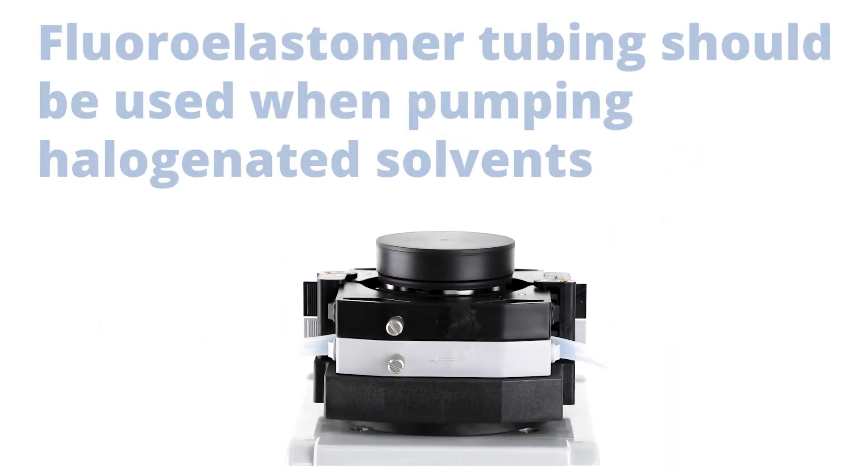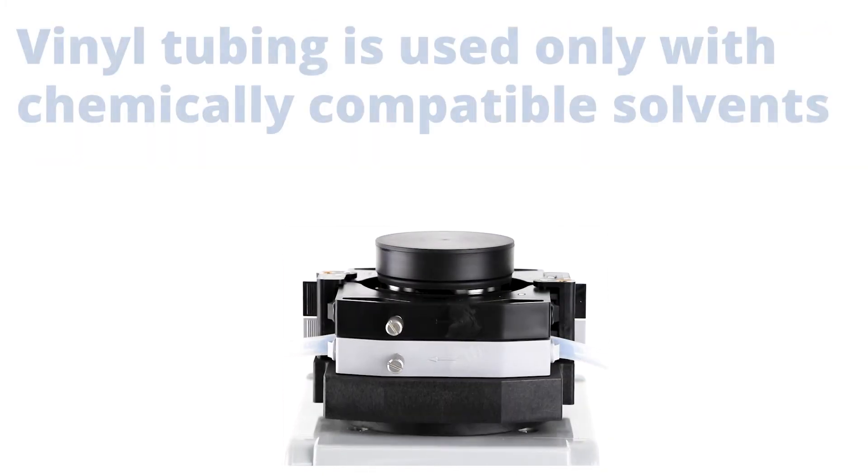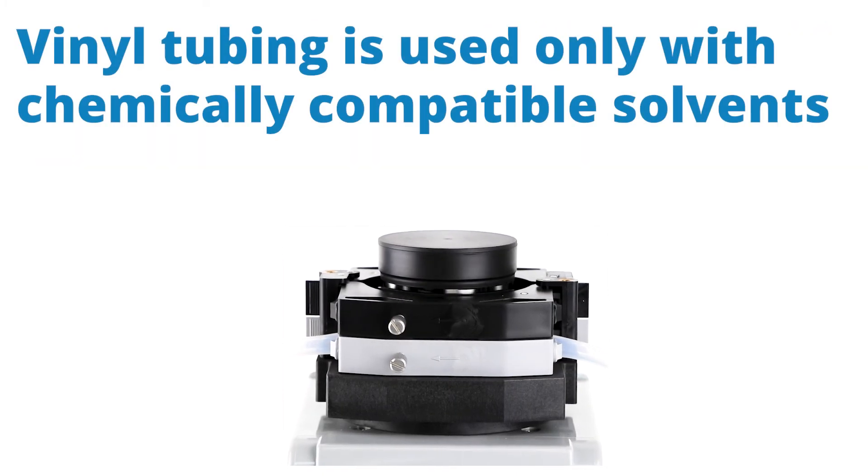Here's a tip. Fluoroelastomer tubing should be used when pumping halogenated solvents. And vinyl tubing is only used with chemically compatible solvents.